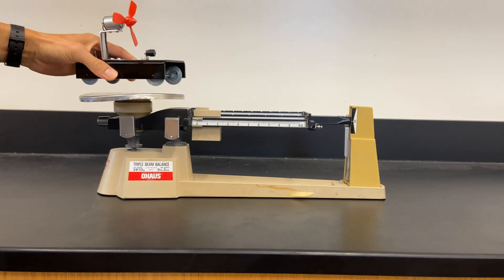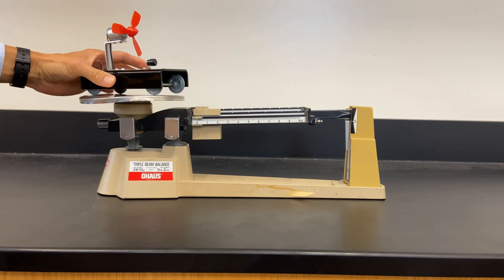Next, you're going to put the item that you're trying to mass on top of the pan. So I'm going to put that right there.